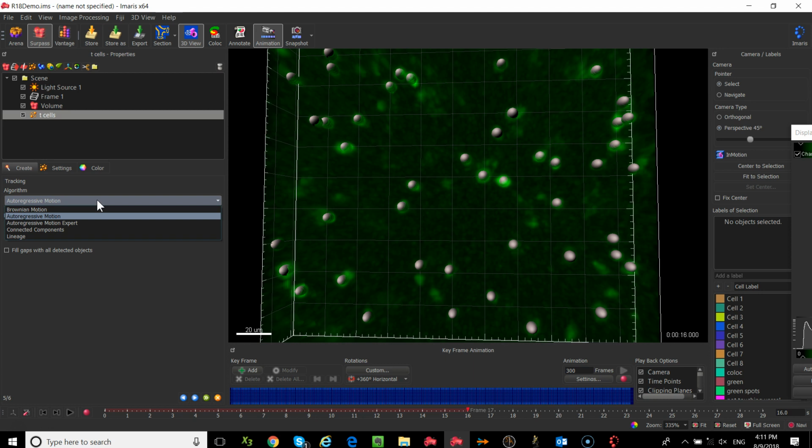If your cells are migrating in a particular direction, whether they're meandering there or going straight there, and you can visualize that movement as always in a forward momentum, you're going to use autoregressive motion. If your cells are moving randomly, or if sometimes your cell moves forward and then backward, you're going to use Brownian motion. And if you just don't know, use Brownian motion.